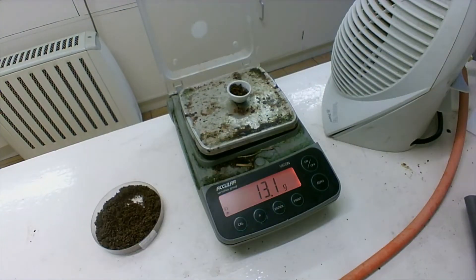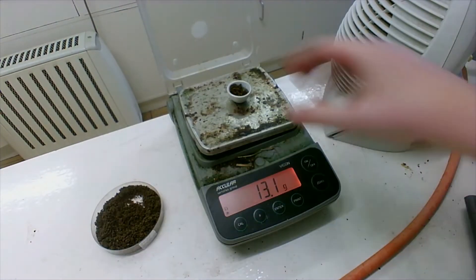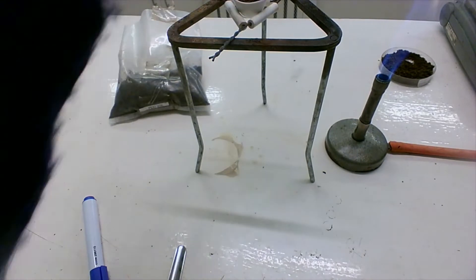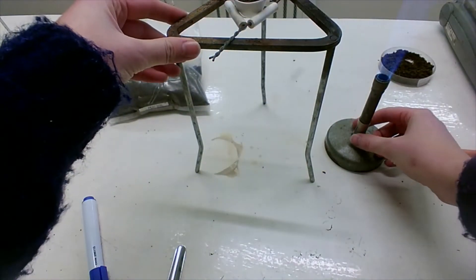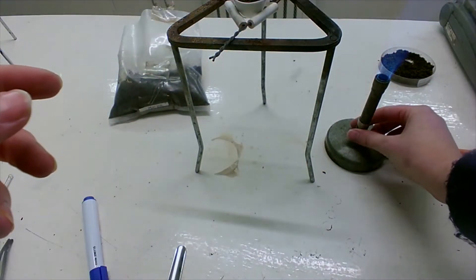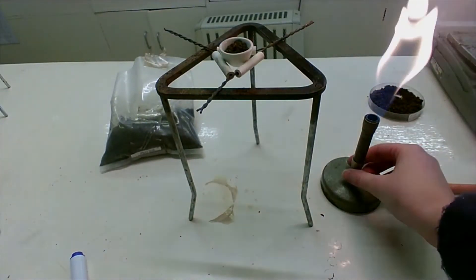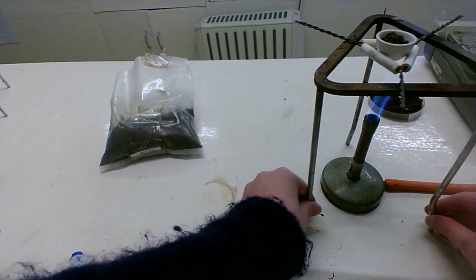I have about three grams in the crucible. I get the crucible and I'm going to put it here on the pipe clay triangle and I'm going to put it over the Bunsen burner. When you're not using the Bunsen, you have it on this safety flame, and then this is going to burn the soil sample.